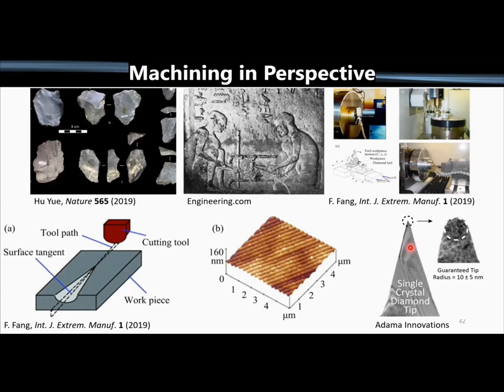Yeah, they're more expensive. Maybe on the order of 150 euros per probe. Yes, I believe. But there is a picture here from the company. So Adama Innovations is the name. But only one company produced it? Well, I think other companies as well, other manufacturers or vendors have sold diamond probes. Diamond must be conductive diamond. Yes. For doing PFM or conducting AFM, you need to use a conducting diamond.